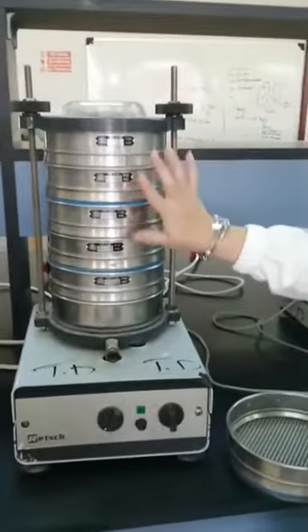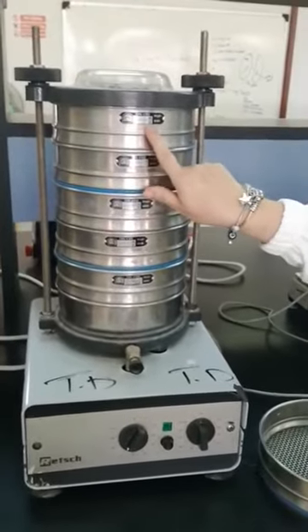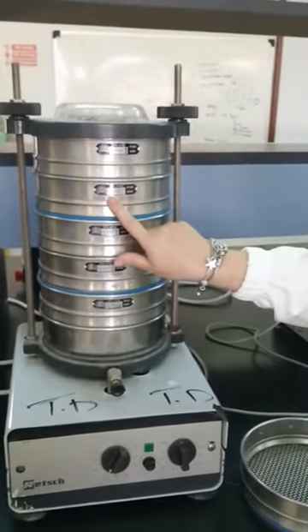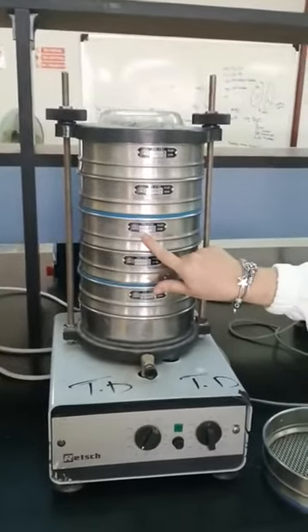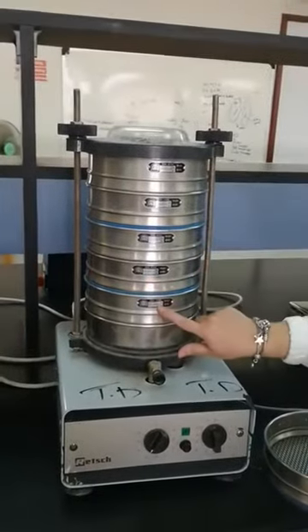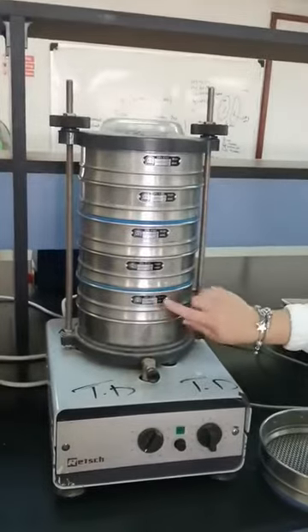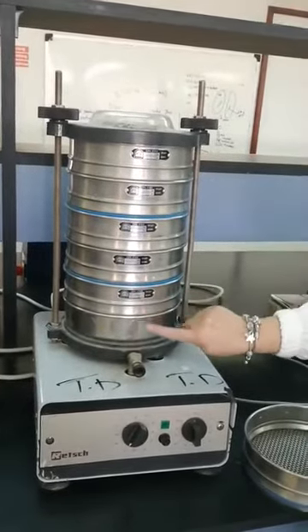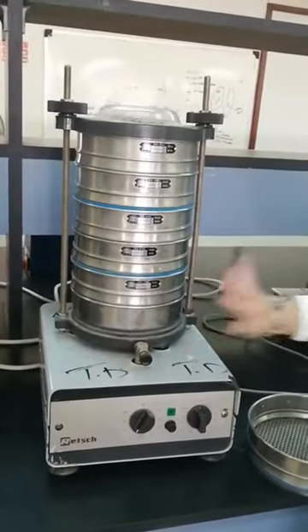We have 5 sieves, as we said: 2000 micrometer aperture, followed by 1000 micrometer, then 500 micrometer, followed by 180 micrometer, and finally 63 micrometer. To collect the powders less than 63 micrometer, we put a tray at the bottom of that nest.